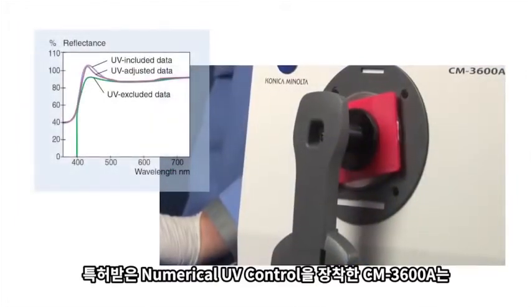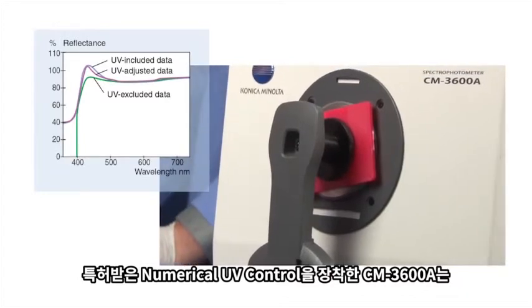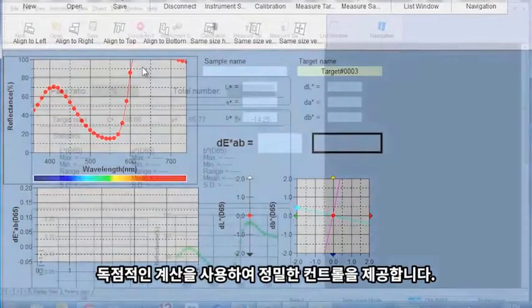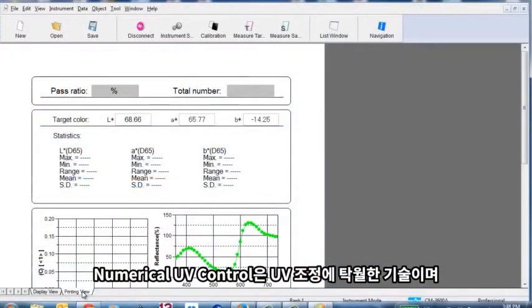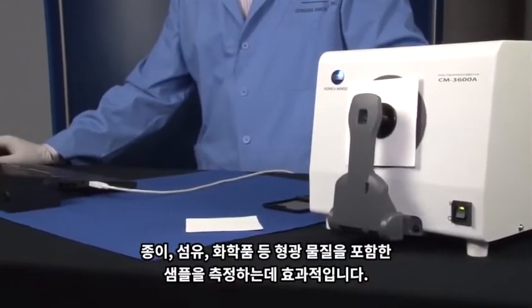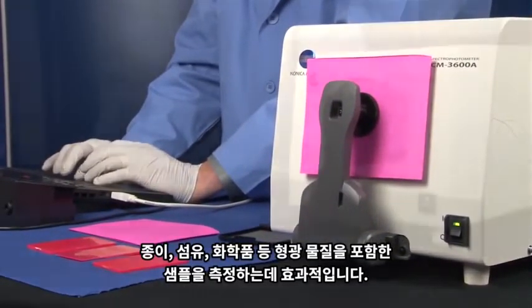The patented numerical UV control method used by the CM3600A provides precise control by using proprietary calculations to combine the results from flashes of two xenon lamps. Numerical UV control is the unsurpassed technology for UV adjustments when measuring samples containing optical brighteners such as paper, textiles, and other chemicals.